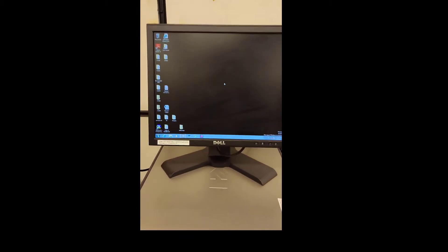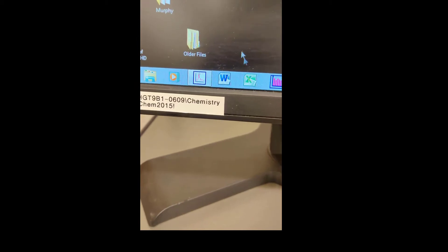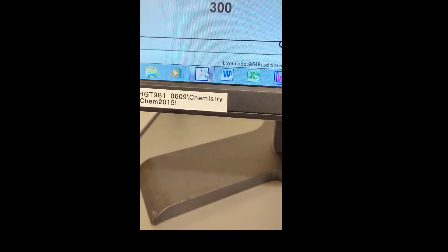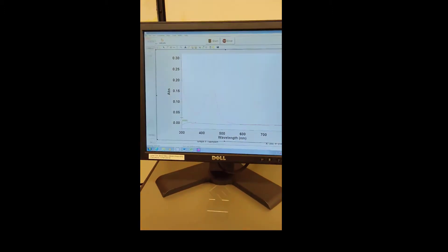In the meantime, we can open up the software and set up our method. That's what the software icon looks like. Just click it, open it up, and you should see a display that looks something like this.